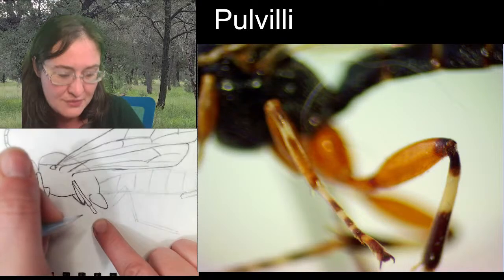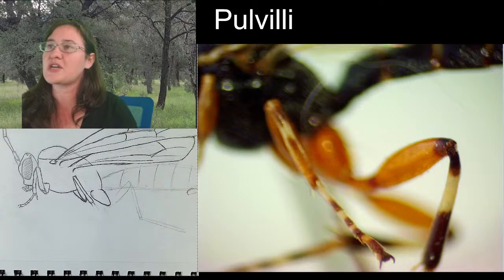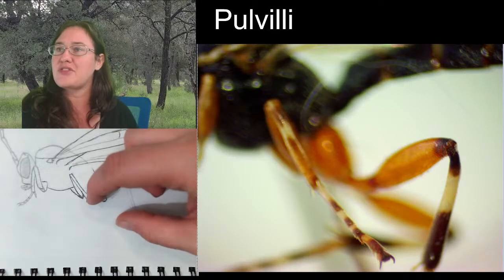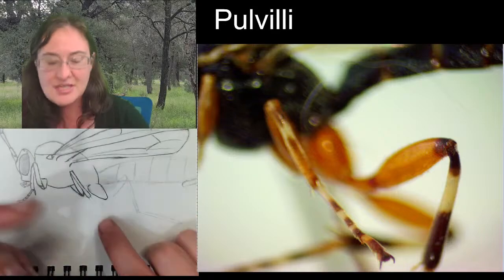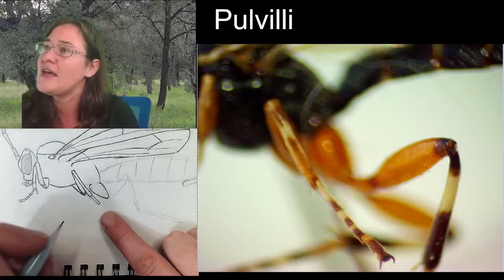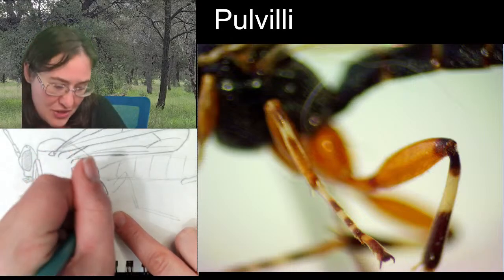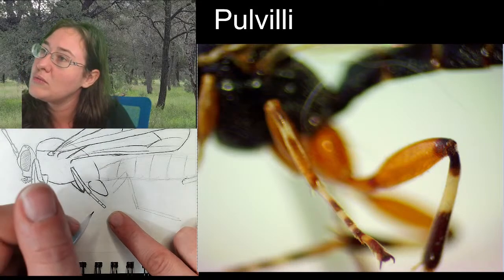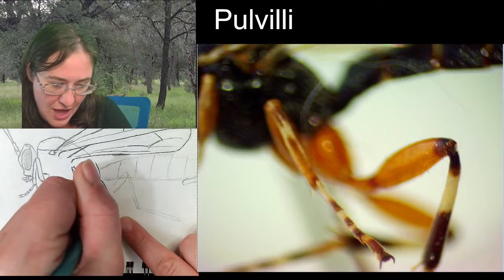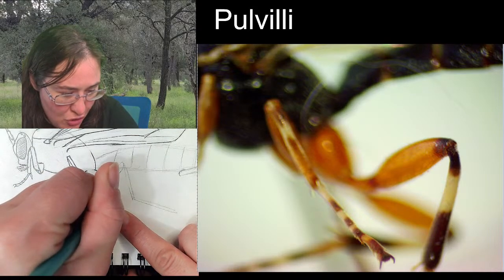They're nice and long and thin, and they make our legs look really long. The tarsal segment's pretty much double the length of the tibia, at least. So if you got the tibia here, you've got the tarsal segments, and they're going to be just as long as that tibia was. The first segment looks like it's the longest. It's going to be nice, long, and thin. And then the second one is about half that, and the third one is probably the same length as the second. And the fourth one is this one that kind of comes out and it's globular a little bit because you've got the tarsal claws at the end and that toe pad.